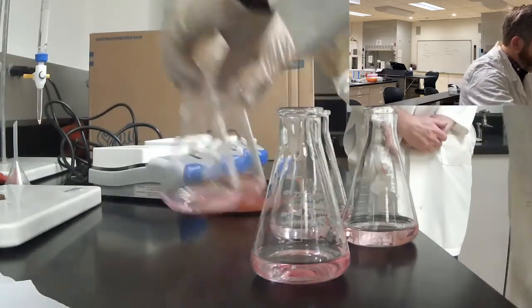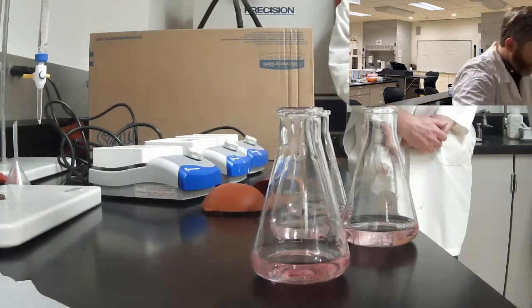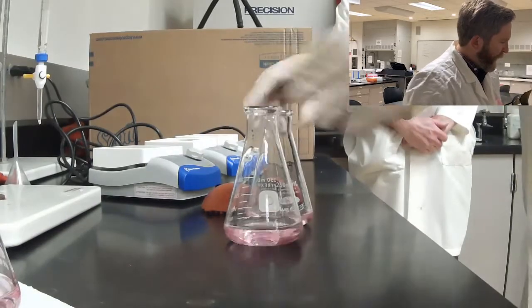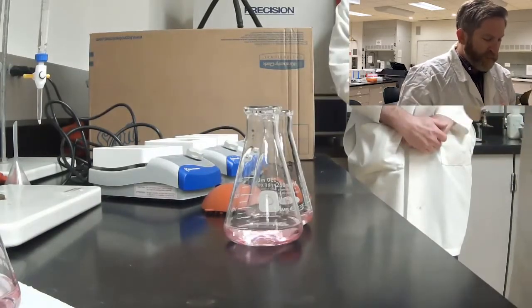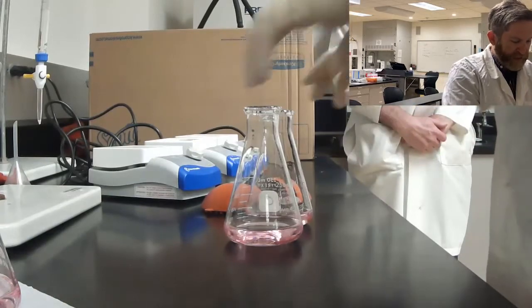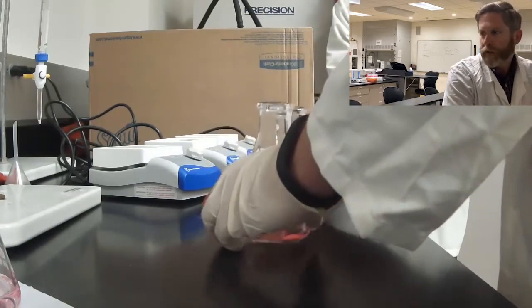Okay, so I set some of these aside for our antacids, and then for the first 2, we're going to add some sodium bicarbonate that we're going to measure on the balance, and then put that into here, and make sure that we have enough acid so that there's an excess of acid.